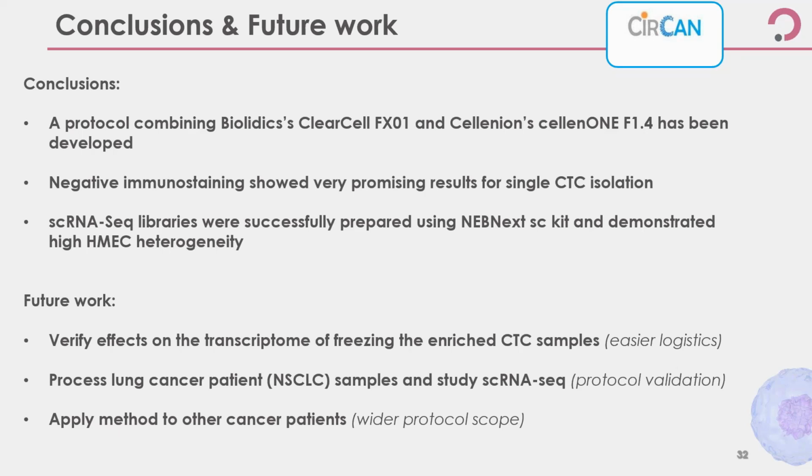After that, Professor Léa Payen will process some lung cancer patients, non-small cell lung cancer patients, and prepare single cell RNA-seq libraries from those. And obviously, we would like to apply this method to other types of cancer to demonstrate that this protocol can be used for a wider range of patients.